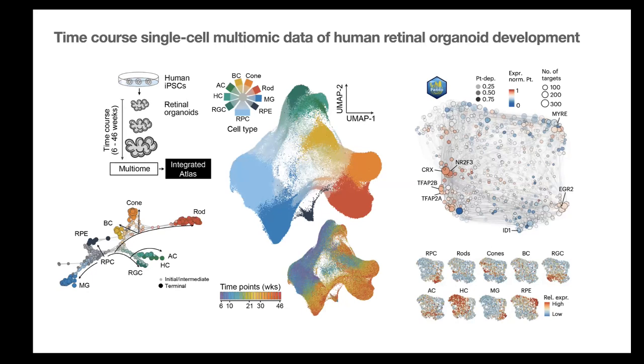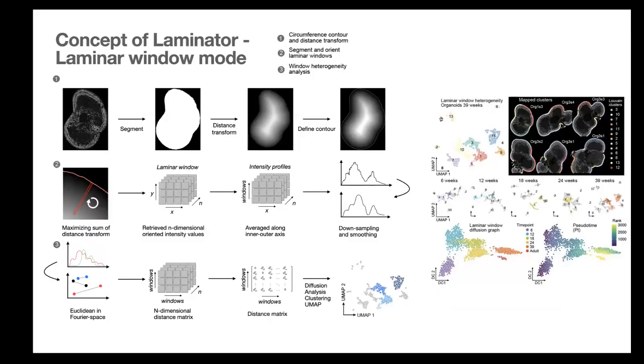Yeah, now bringing in the single cell data. So Shisong did this whole... So before you go on, I want to make sure I understand what you've done here. You're taking a slight cross section of your organoid, and then looking at the intensity profiles of the different channels, the different stains that you have, and quantifying how that changes spatially across that section. Exactly. And that will tell you whether your organoid is at its final destination.